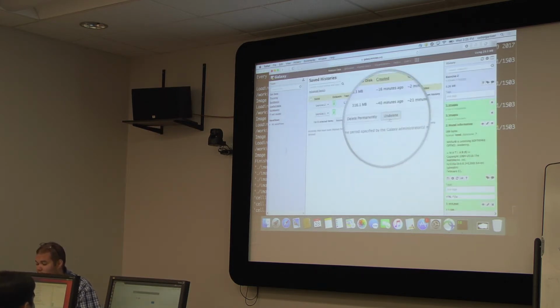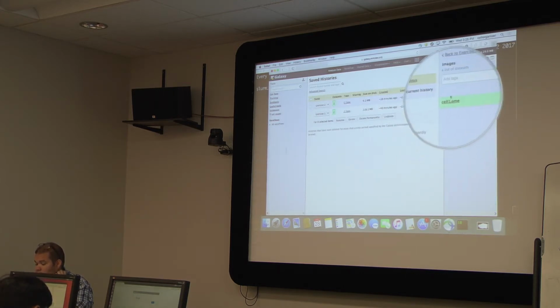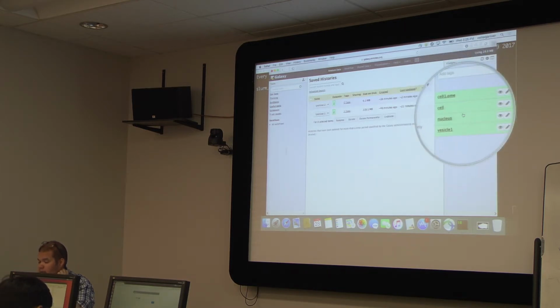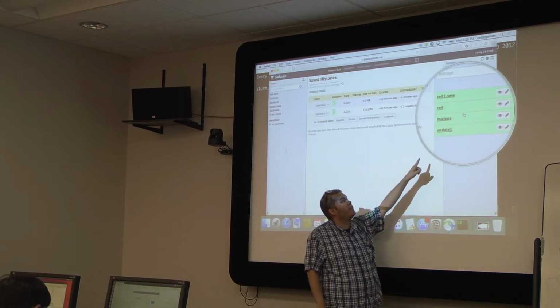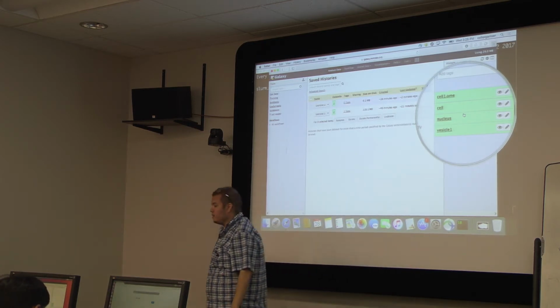You can select whatever. So let's see, I got here, this is the image that I trained before, right? But now, if I go back to this second data set, I have more files. In this case, CellOME, which corresponds to the OME TIFF, and then those 3 components that are the 3 OBJ files that were generated by CellOrganizer.